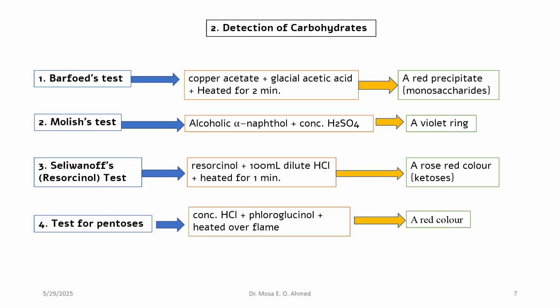Besides its function as a source of energy, carbohydrate can be a part of glycosides, which can be used for solubilization or transport of these glycosides, and mainly transfer of the aglycone as the active or physiologically active part of glycosides. Here we have 4 types of qualitative chemical tests used for detection of carbohydrates in plant extracts.